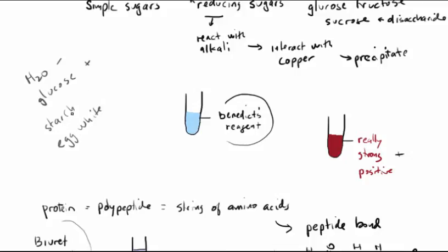Well, it turns out that the only parts of the starch that can reduce the copper ions are those molecules at the very ends of the chain, right? So in a polysaccharide, you've got a really, really long chain of glucoses, and it's only the molecules at the end that might have the opportunity to cause this reaction to take place. And we don't have very many of those ends, so there really isn't a strong Benedict's reagent reaction. In fact, you're not able to detect it at all. Egg white, similarly. For all we know, there might be something in egg white that also causes it to react with the Benedict's reagent, and we want to make sure that that's not going to be happening, so that we can interpret our results later on with great confidence.